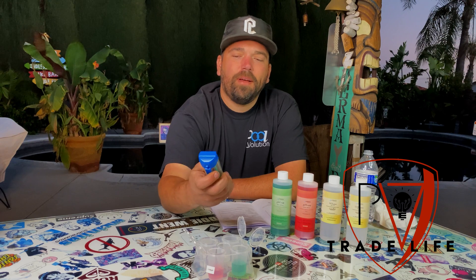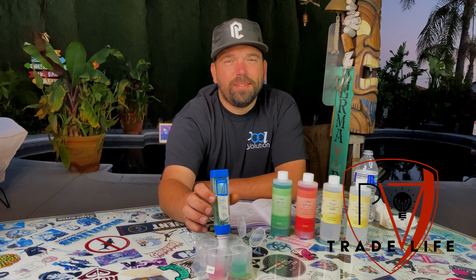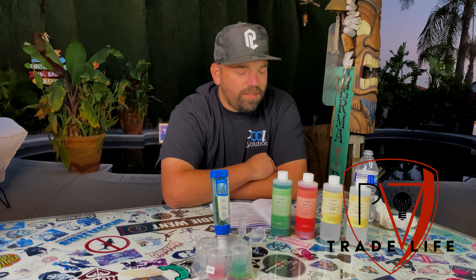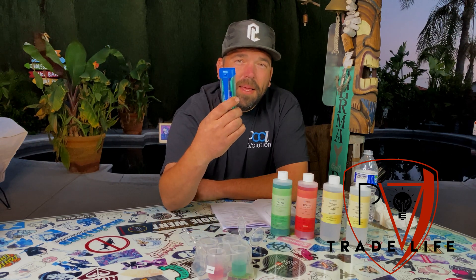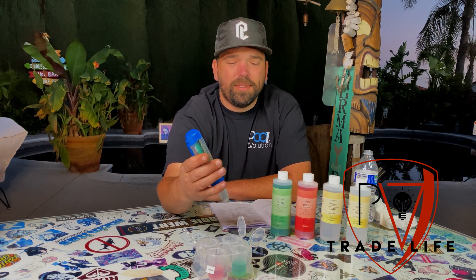So when you turn this on, you can have a light, which I like because you can see it a lot better. It takes four AAA batteries. The compartment is clear so you can see what's going on — sometimes batteries get acidic and you can tell it's time to replace them. There are all kinds of cool stuff on the keypad with the mode button and the Bluetooth, which is how you connect to the app.